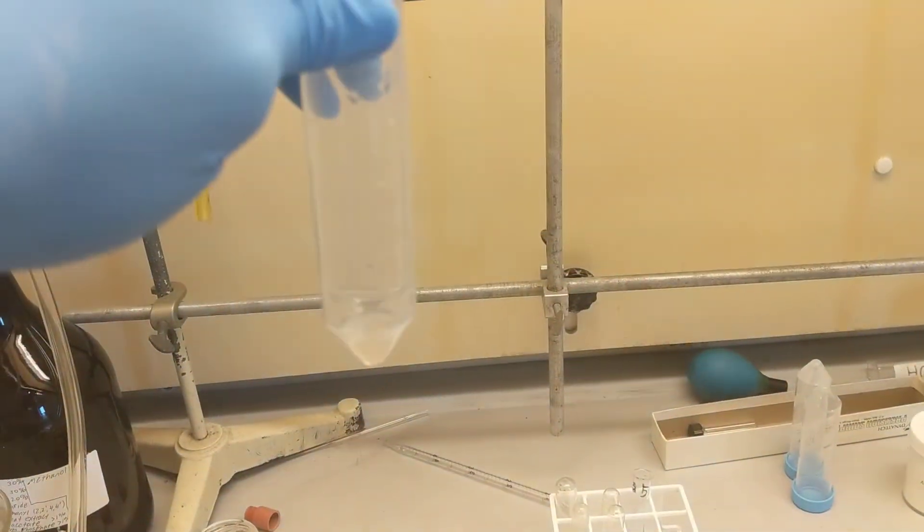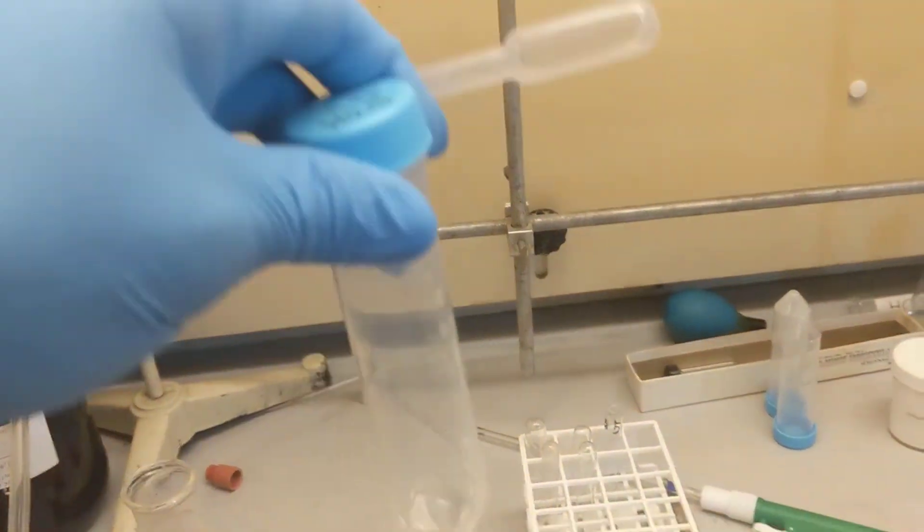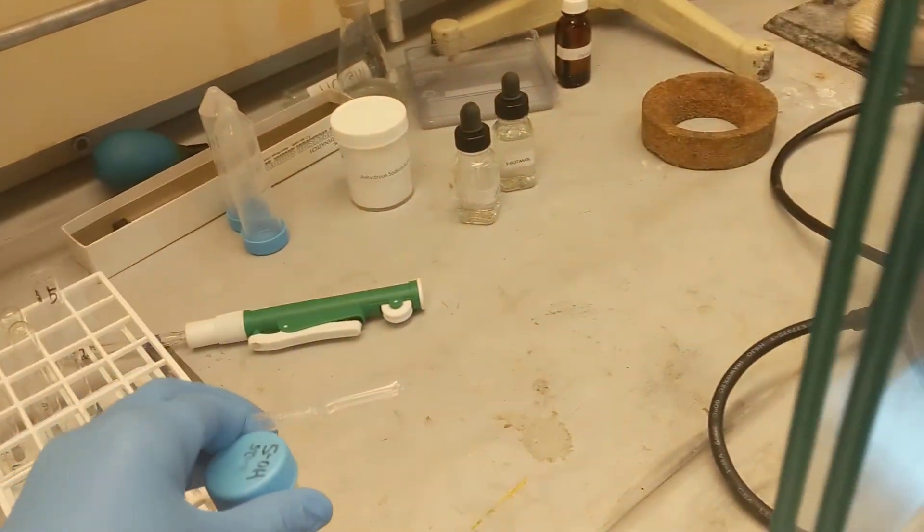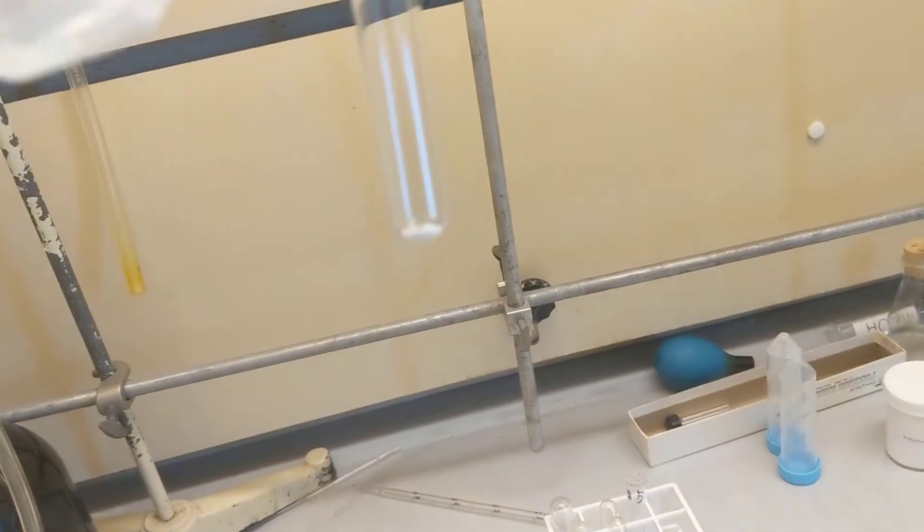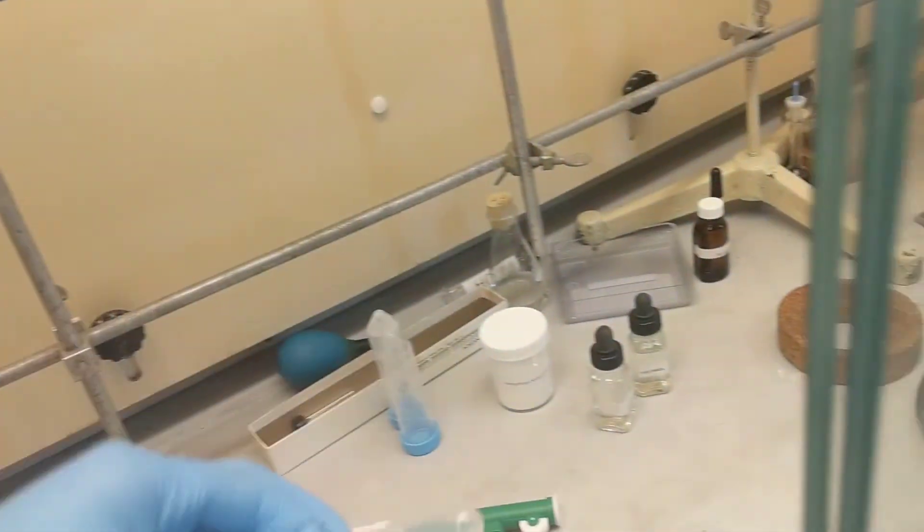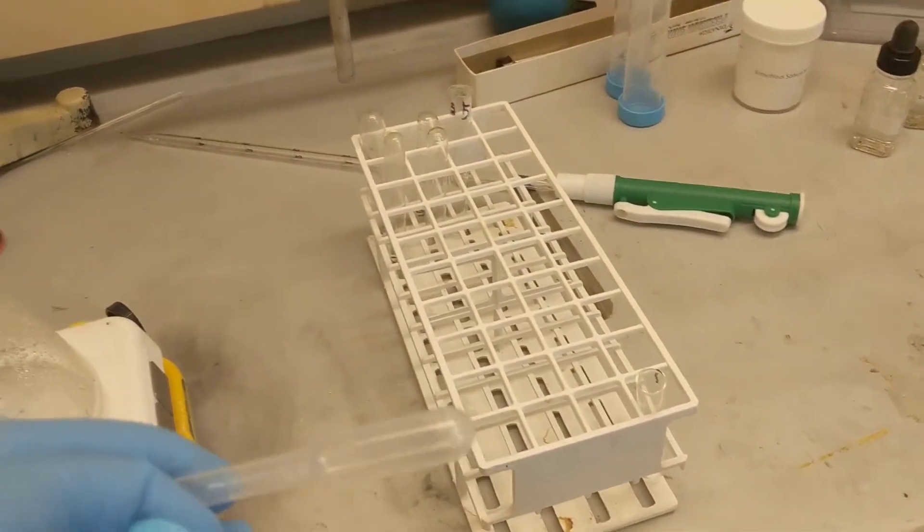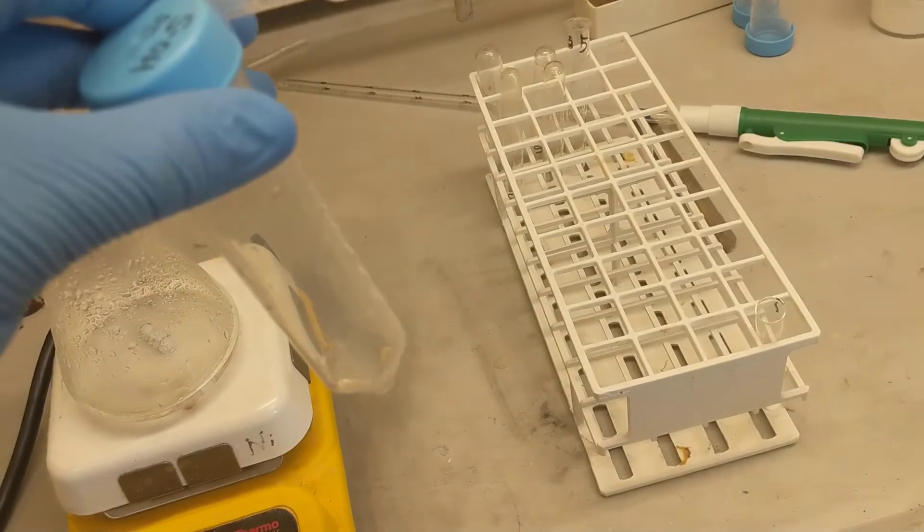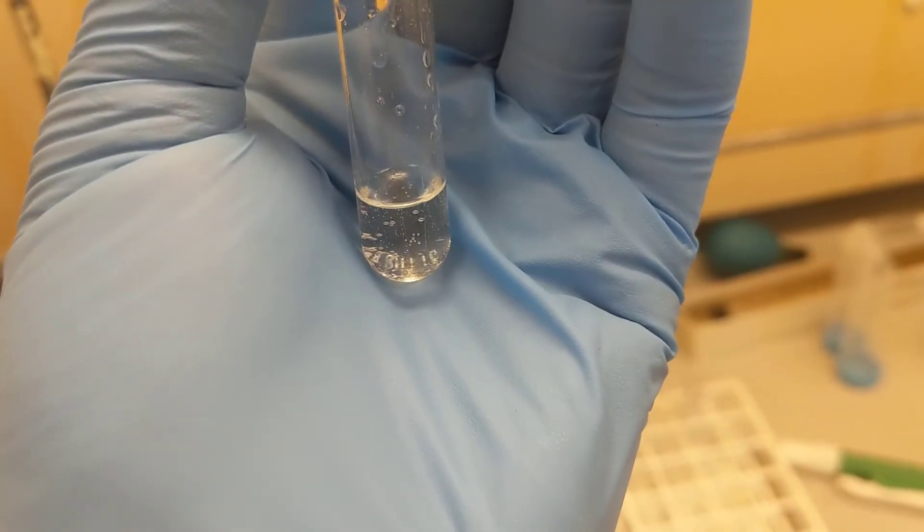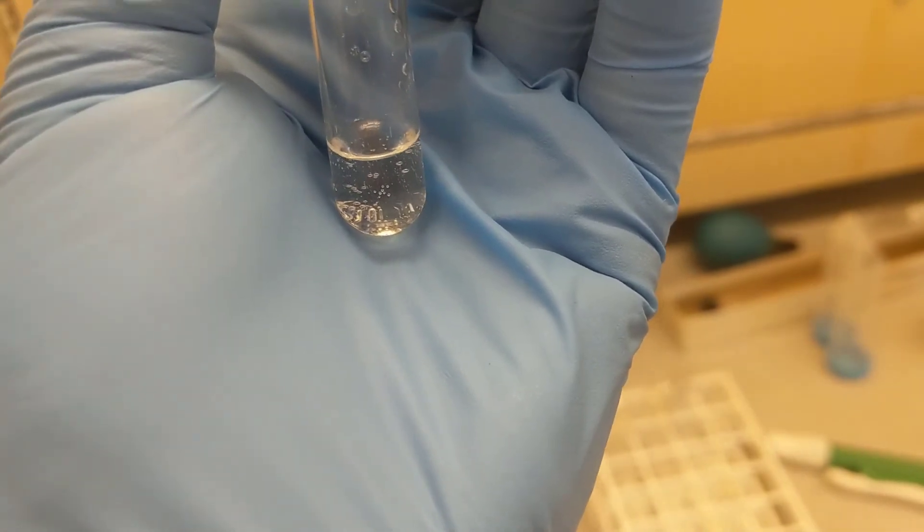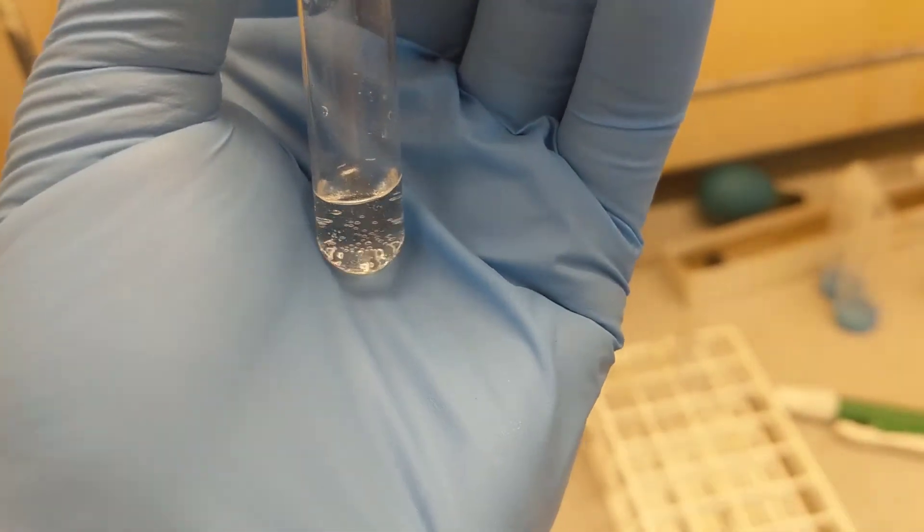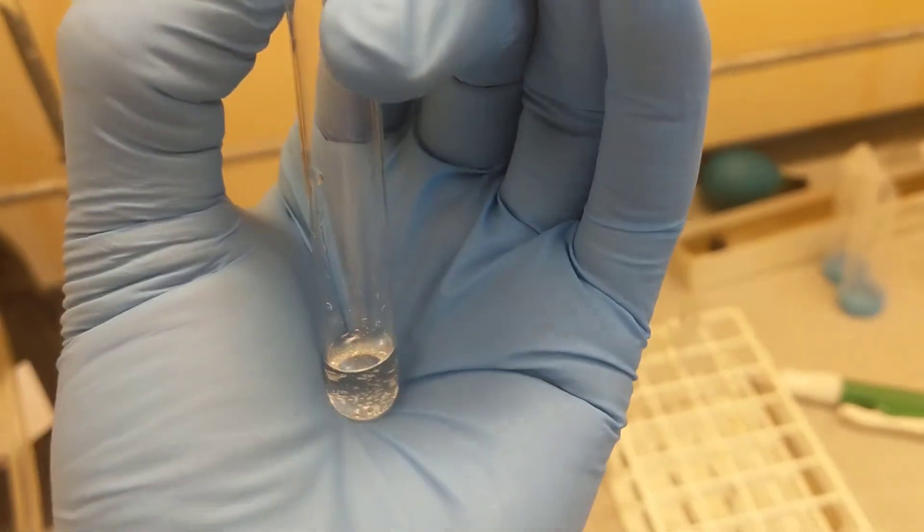I got my aqueous layer for Experiment 20B. I'm just going to add it into this test tube with sodium bicarbonate, wait for the bubbles to stop, transfer it into my vials, and be done with 20B. You can see all those bubbles coming up, so I'm just going to wait for those to stop and then transfer it into my vial. Then I'll be done with 20B.